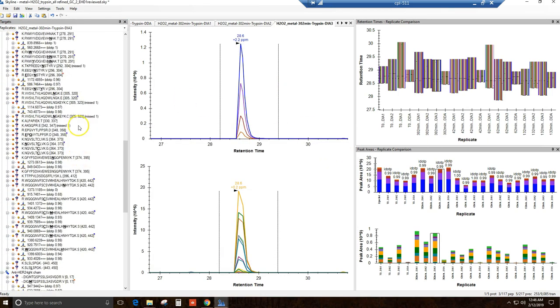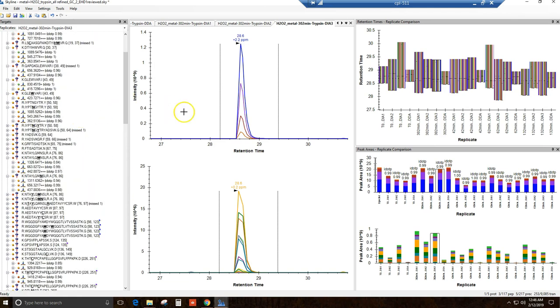For each sampling time point, we have 3 DIA scans for each of the triplicate digestions, and 1 DDA scan for one of each triplicate digestion set. There are 4 scans at each time point. For every identified peptide, the data shows very low mass errors, consistent retention time throughout the batch processed file, and isotope dot product scores above 0.95. Users only need to adjust and ensure the retention time and peak integrations are correctly selected.